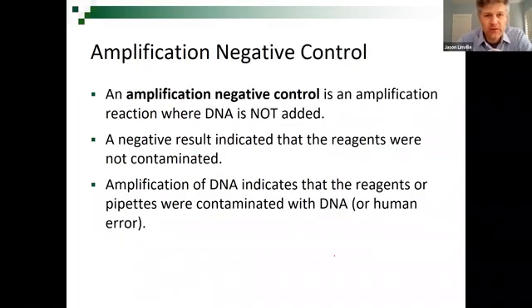All right, a negative control is an amplification reaction you run and you don't put any DNA in it, okay? You just squirt water in there that is nuclease-free, doesn't have any DNA in there. So what's supposed to happen is nothing, okay? Negative control, you put it in the thermocycler, run it through, you load it on your instrument, and you get no amplified DNA, no human profile. That's what's supposed to happen.